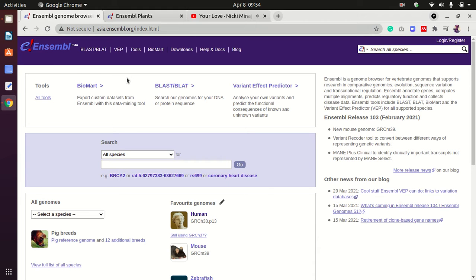First, we have to go to the download section. Here we have a download section.